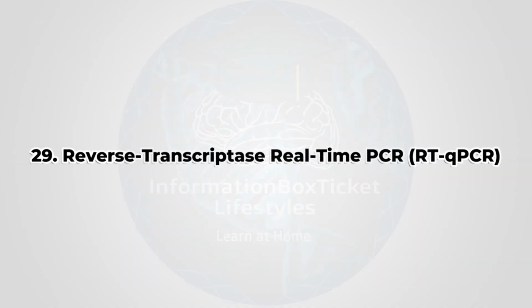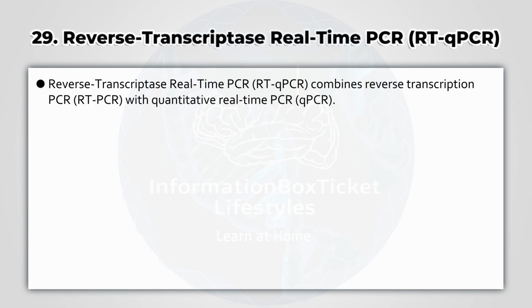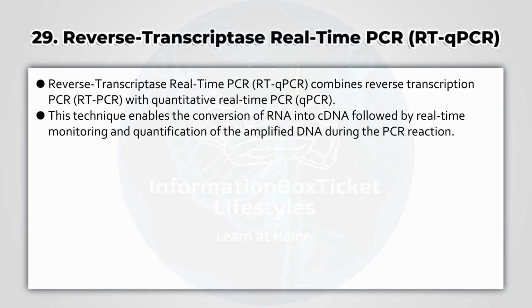29. Reverse transcriptase, real-time PCR, RT-qPCR. Reverse transcriptase, real-time PCR, RT-qPCR, combines reverse transcription PCR, RT-PCR, with quantitative real-time PCR, qPCR. This technique enables the conversion of RNA into cDNA followed by real-time monitoring and quantification of the amplified DNA during the PCR reaction.